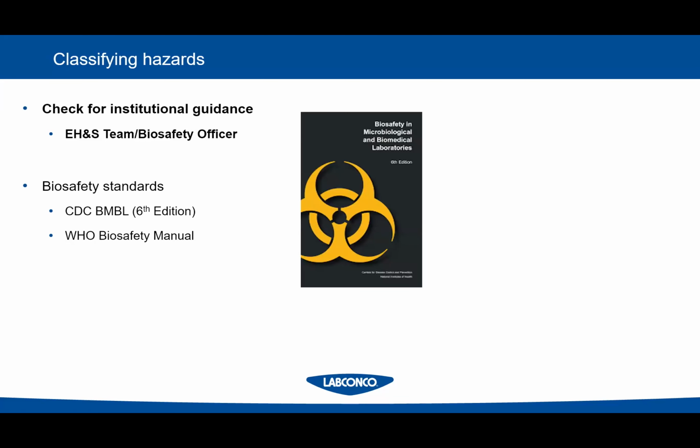There are 2 biosafety standards out there that a lot of biosafety officers look at for guidance as far as hazard and where they're classified. That would be your BSL 1, 2, 3, 4. This book is called the BMBL. It's put out by the CDC. It's also referred to as the Bio Bible. It talks about how you ventilate labs, what primary engineering controls you need to have, how they need to work, what you need to have in place, all those good things, okay? It talks about different cabinet types, what they do, what they don't do. And then the World Health Organization also has a safety manual. It's very similar.